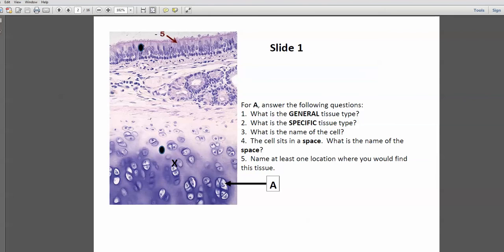We don't have any striations, so we know it's not muscle tissue. So we've got connective tissue. And you see little spaces called lacuna with the little cell in the middle, or as I like to call it, the Matata in the middle of the lacuna. All right, so this is cartilage. Cartilage looks like little eyes looking back at you. And the cell is a chondrocyte.